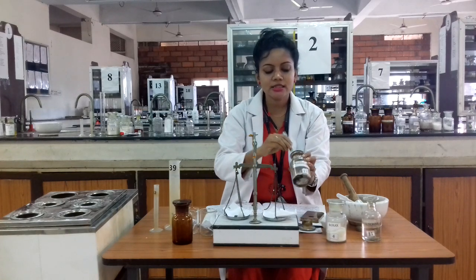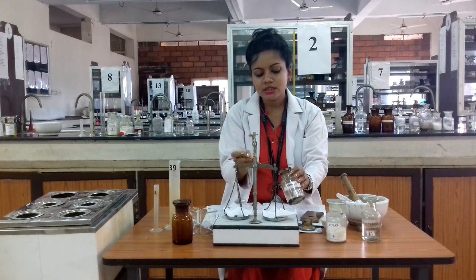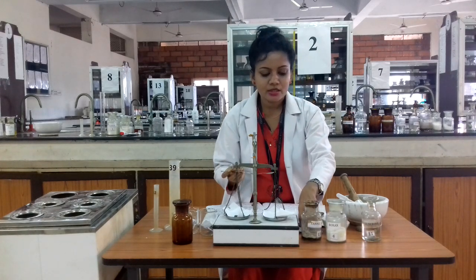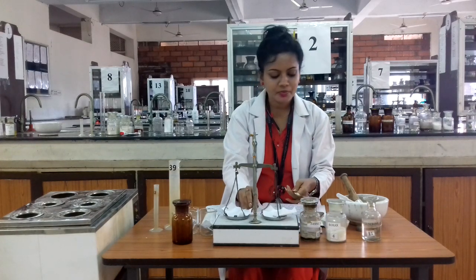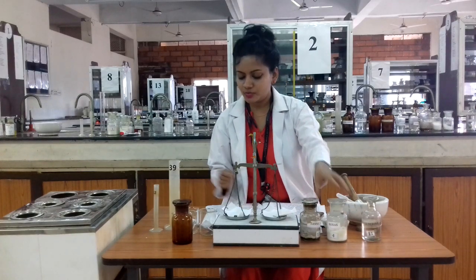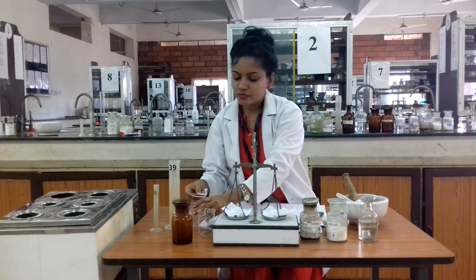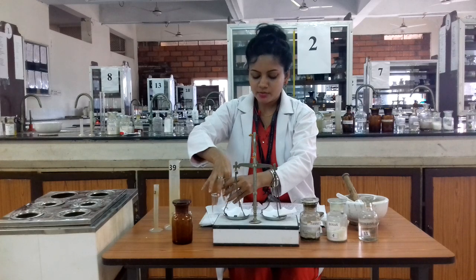Tannic acid has good astringent properties — it contracts the tissues, which is helpful for controlling infections in the area. Our second ingredient is borax. We need 0.2 grams of borax and 20 ml of glycerin. I have already weighed 2 grams of tannic acid and 0.2 grams of borax.